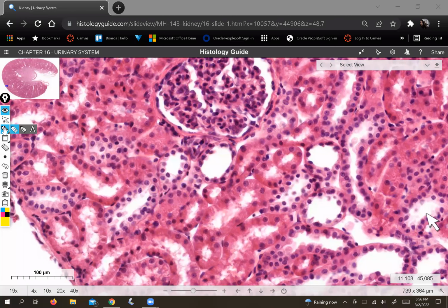So microvilli make a really messy apical surface of an epithelium, meaning the apical surface is the side of the epithelial cells that face the lumen. And if there's microvilli or cilia present, the apical surface will appear ragged and messy and not clean and uniform, because there are little projections that the knife that we cut the tissue with has to pass through on the way. And so what you get is this messy, disorganized apical surface and lumen appearance.